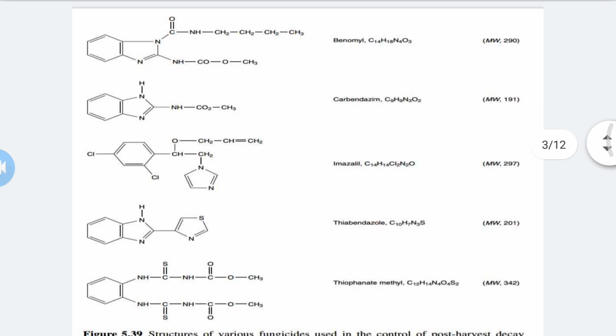If the applied voltage is higher, there is also a possibility of decomposition. So molecular ion formation and intensity depend on the applied cone voltage.